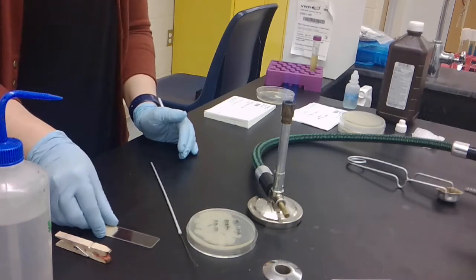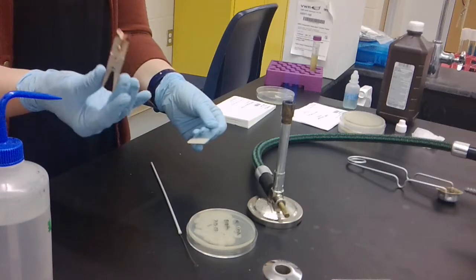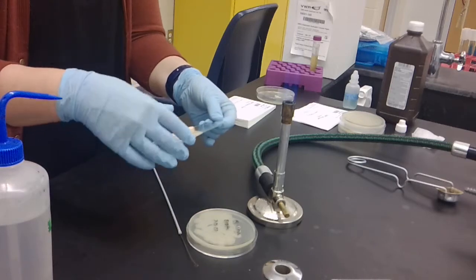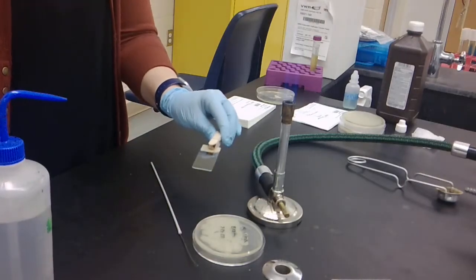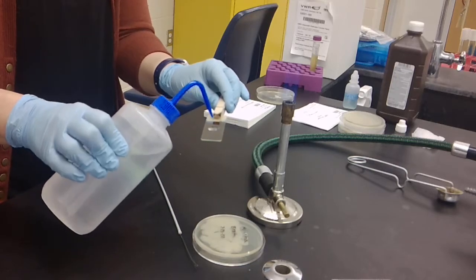To do this, you want to obtain a clean microscope slide from the front bench. We always have clean microscope slides in the room. And you want to hold that microscope slide using your clothespin. You all have clothespins in the bottom drawer between your benches. On your microscope slide, you want to use DI water and put a small drop of water in the middle of the slide.